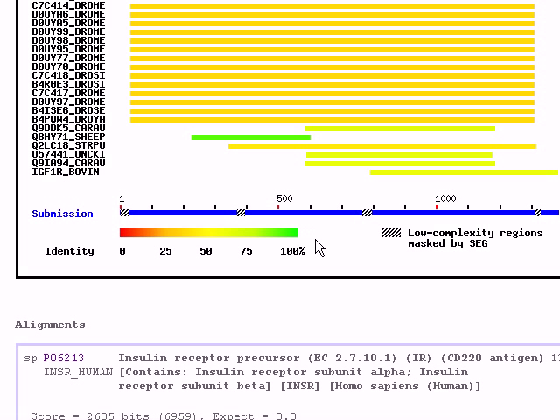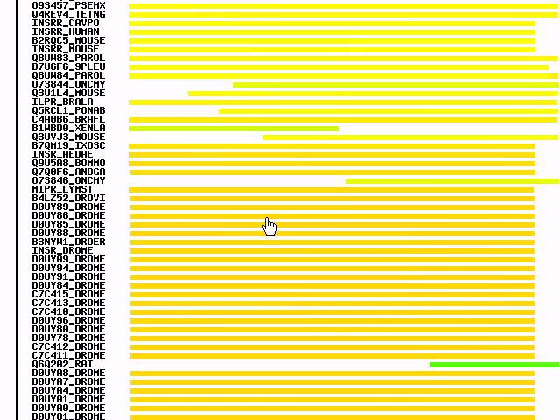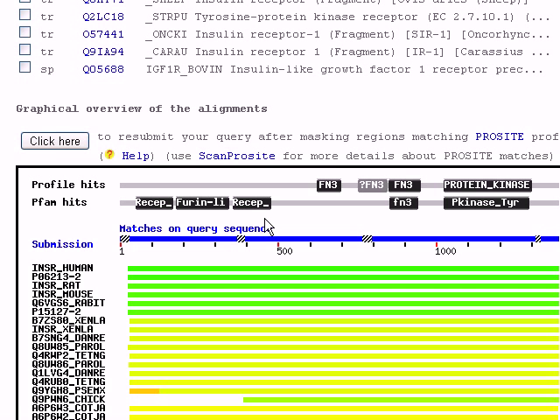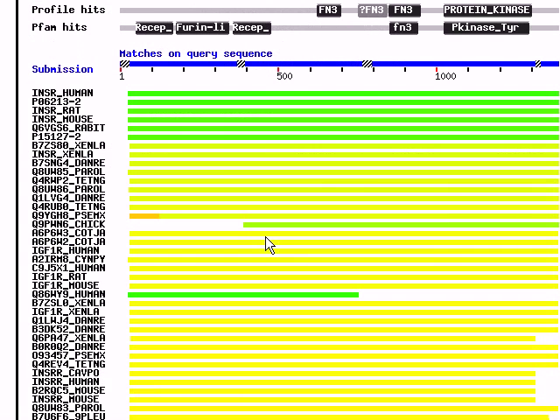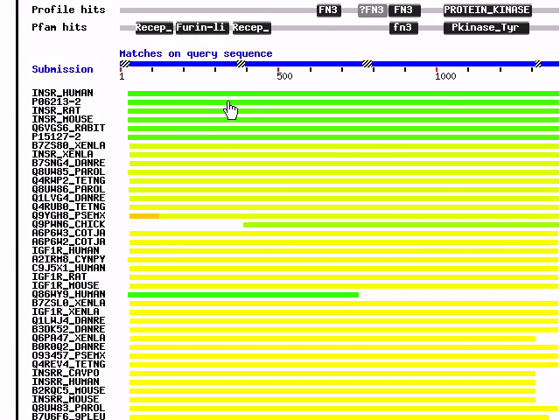For example, if it's green, it's 100%. If it's red, it's 0% or almost. For example, we can see here the first hits. It's human, rat, we have mouse, rabbit.